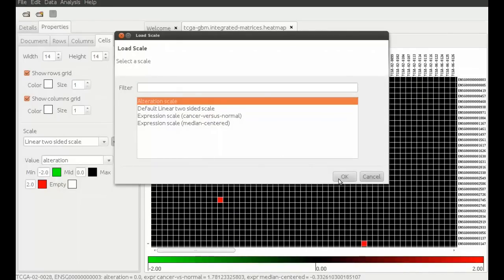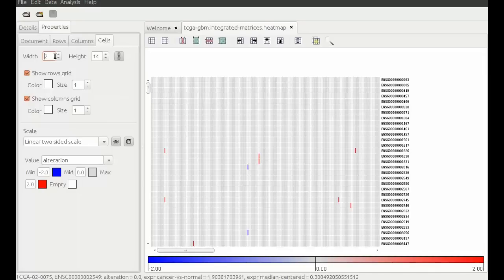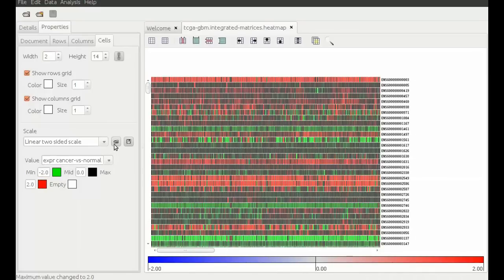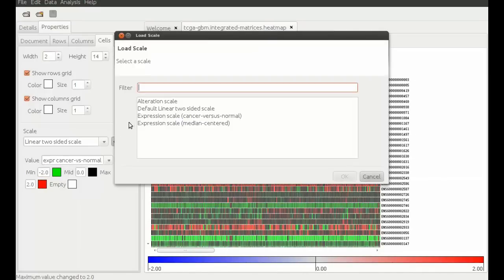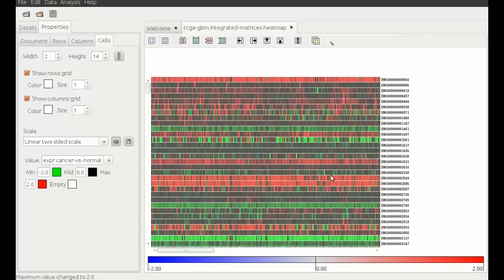This data is best represented by a linear two-sided scale. We select it and load for each value our preferred scale, which we have created and saved before. All the scales we are loading are linear two-sided scales with different color settings.